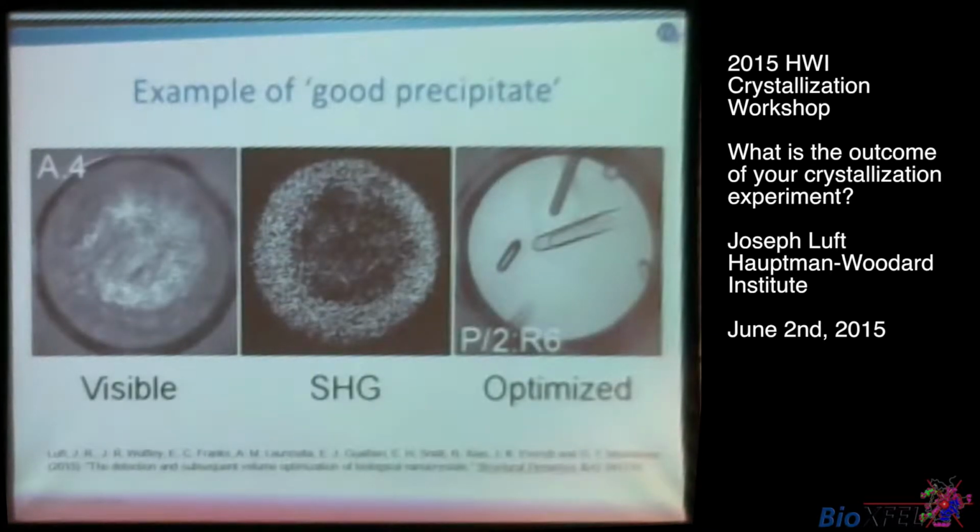And these are just some examples of good precipitates that were identified using the Sonic. The Sonic is nice because the SHG can actually act as a training tool. There are people that spend many years in the lab looking at drops like this under a microscope, and they can tell you that's a good precipitate because they can see some coloration on the edges of it. I can detect something that most normal people can't detect. It's like reading tea leaves. They develop an amazing ability to identify these microcrystals.